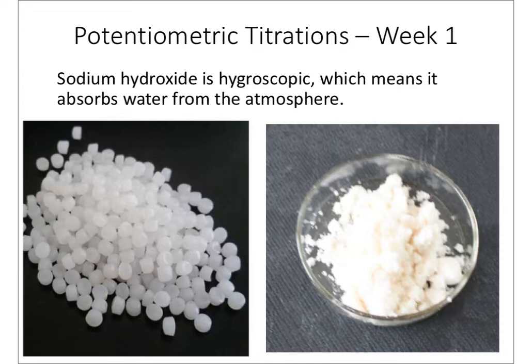hydroxide. The reason that we have to take this first step is that sodium hydroxide is hygroscopic, which means that it absorbs water from the atmosphere. Normally, if you have a brand new sample of sodium hydroxide that you're pulling off the shelf, purchased from a chemical vendor, it'll be these nice spherical shapes on the left-hand side of this slide. But over time, as this container is opened, it gets exposed to the atmosphere, it absorbs water from the atmosphere, turns to mush and eventually begins to melt, like what we see on the right-hand side of this slide.